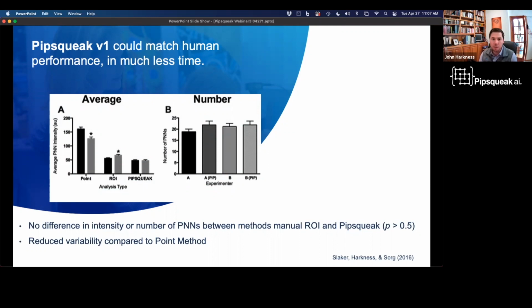In my postdoc, this meant that I was doing a lot of confocal image analysis and then trying to count or otherwise quantify the intensity of some cells like perineuronal nets or parvalbumin staining. What we found in my lab was that it was very hard for us to be accurate across individuals, especially if we were to bring in summer interns or people like that who just don't have a lot of experience. So we wanted a way to standardize it and improve the accuracy.